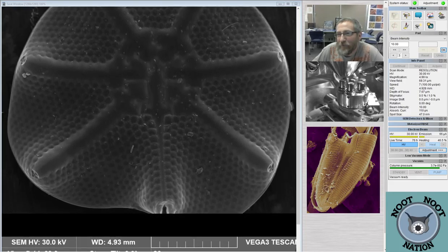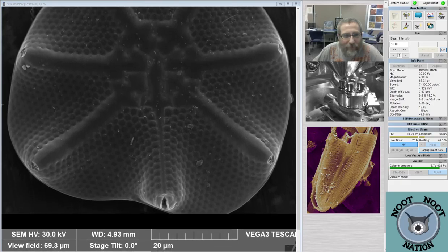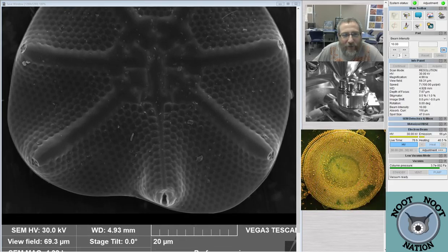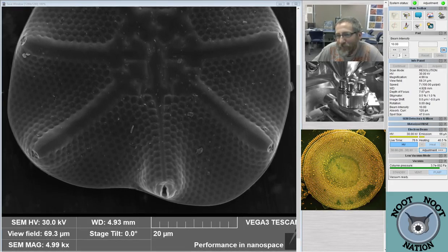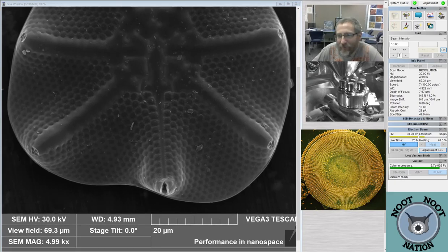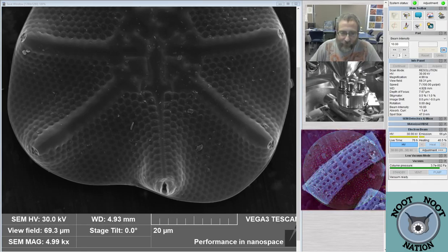I'm looking up what Astromphalus means, the literal translation. Oh, it's a star-shaped belly, wasn't it? Yeah, I think so. As soon as I say it, I'll second guess myself. That's what you told us the other night. Yes, which makes sense. Astro definitely means star. Here we go. Astro, star. Omphal is the navel. So it's star navel. Yeah, star belly.